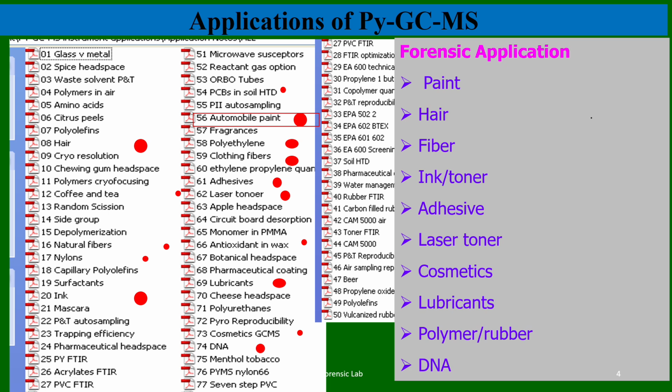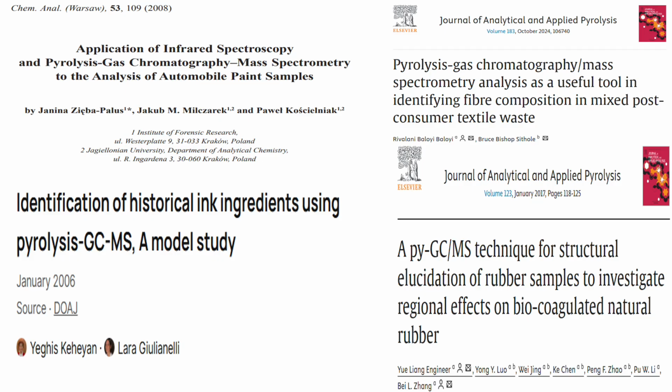And as we know, in the present era everything contains organic compounds, synthetic compounds. So this is a very useful technique. For reference, this is used in paint analysis.